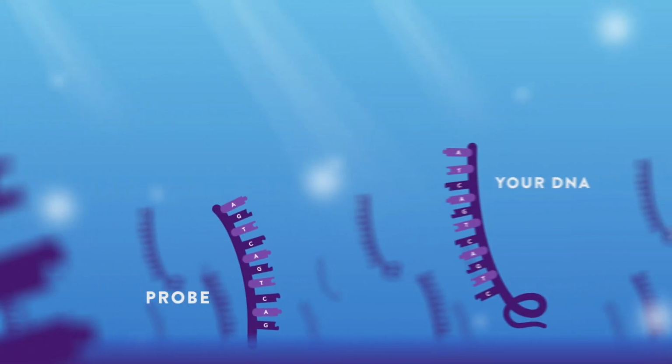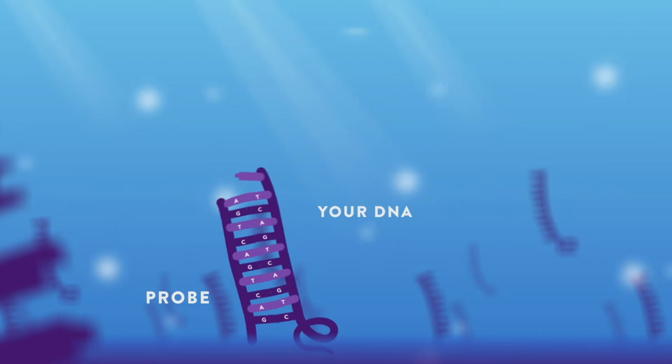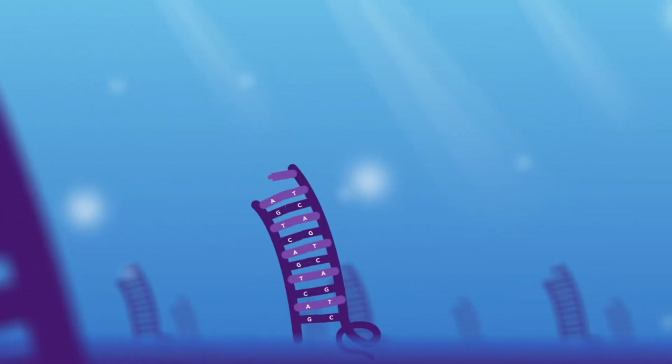So when we add your purified, chopped up DNA to your chip, it's a free-for-all. Millions of tiny chunks of your DNA are swimming around looking for their matching probes. Kind of like trying to find your tiny genetic soulmate in a huge crowd. Aw, that's sweet. But it can take a long time to find your perfect match in a crowd. Fast forward about 24 hours, and by then, most pieces of your DNA have found their probe soulmates.